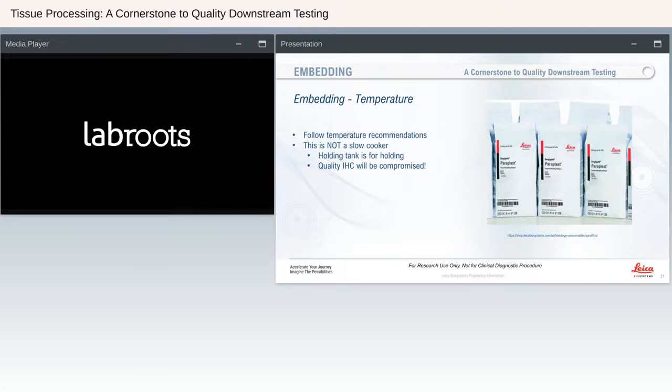Please be sure that we talked about the type of paraffin that's needed for your laboratory. Follow the temperature recommendations on whatever paraffin you may purchase. Please remember that this is not a slow cooker. I have been in laboratories where tissue cassettes were taken off the processor, placed on the embedder, and either had intentions of embedding within an hour or so, and had an account where the cassettes had actually been in the embedder for a couple of weeks.